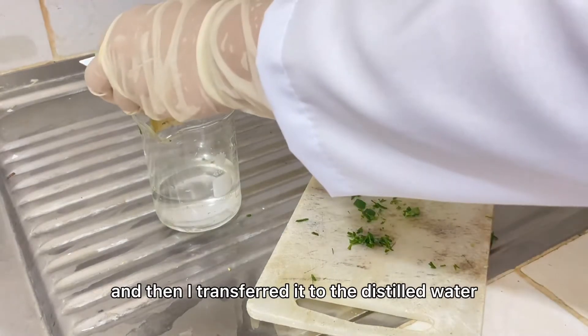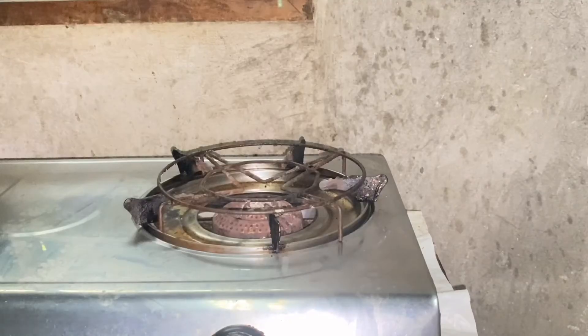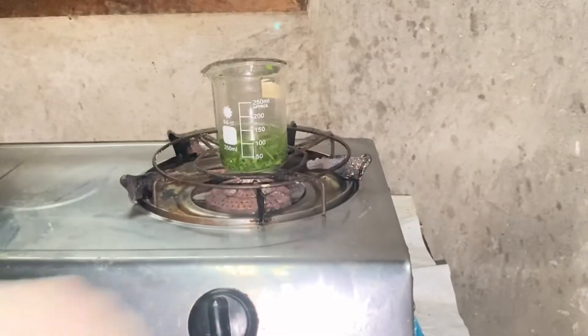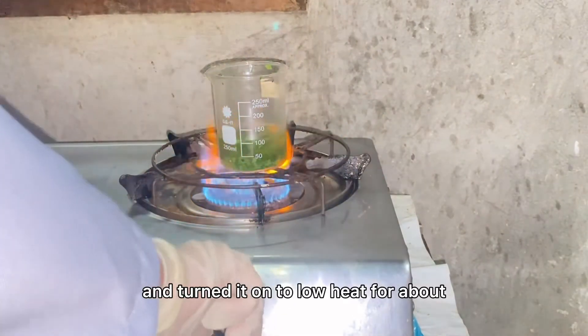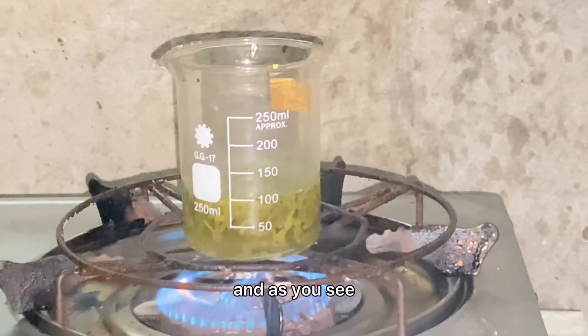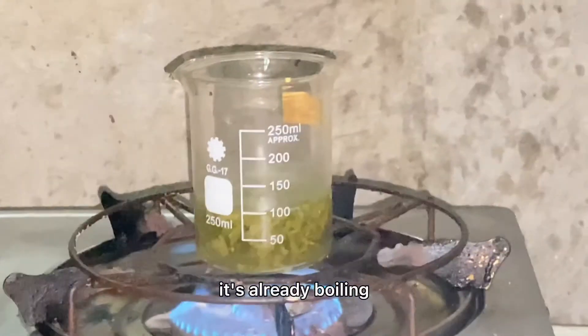I transferred the leaves to the distilled water and placed it in the burner, turning it on to low heat for about 15 minutes. As you can see, it's already boiling.